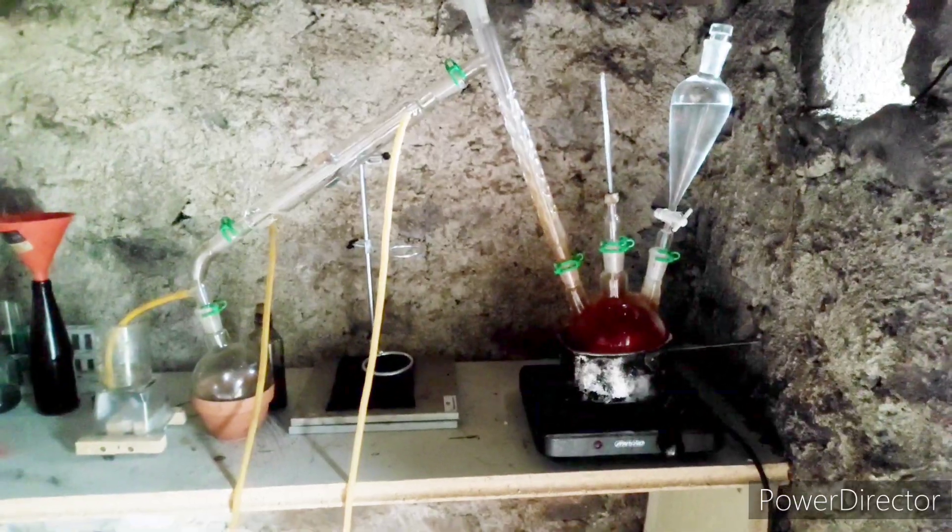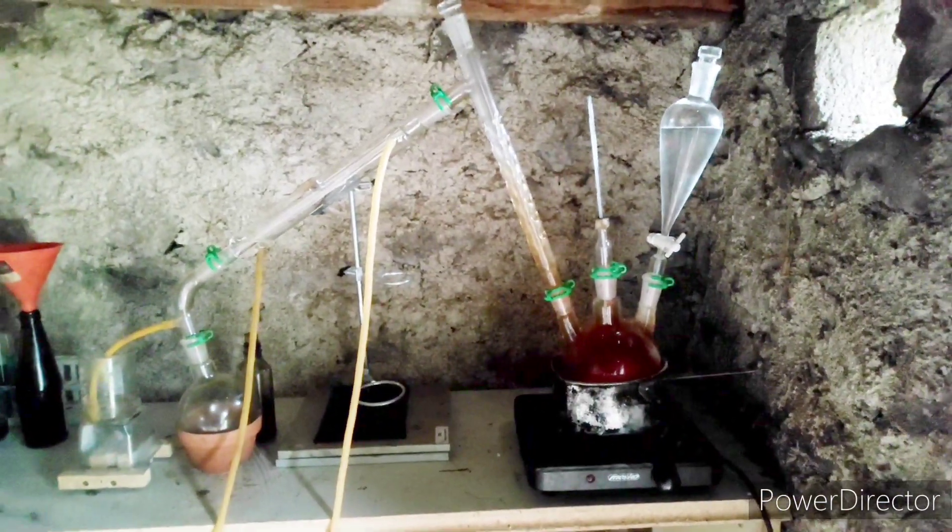My hot plate is a bit broken and sometimes heats too much, which is why I'm using a sand bath in the column. I want to avoid water coming into the distillate.